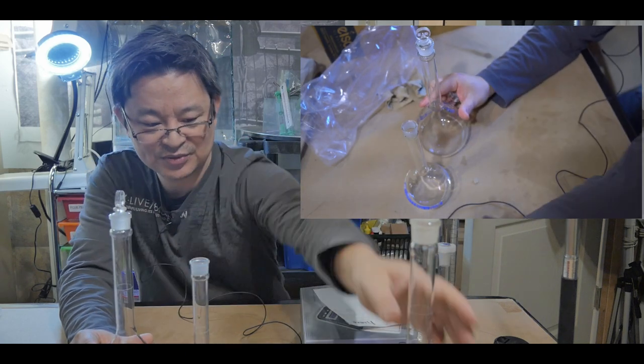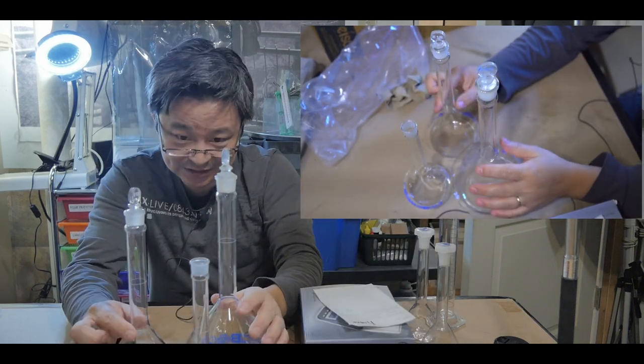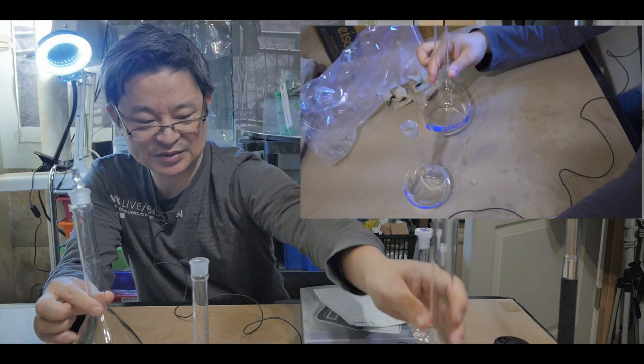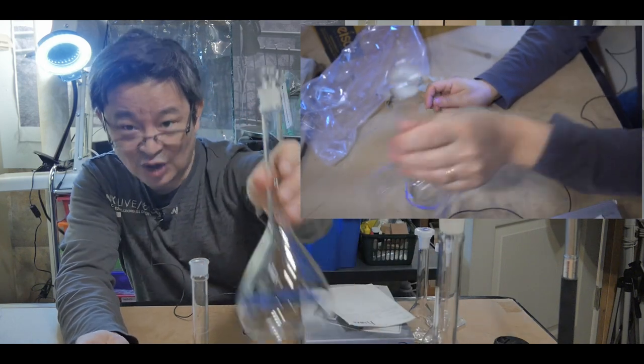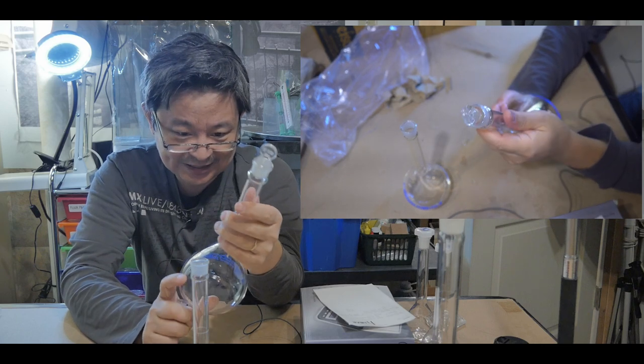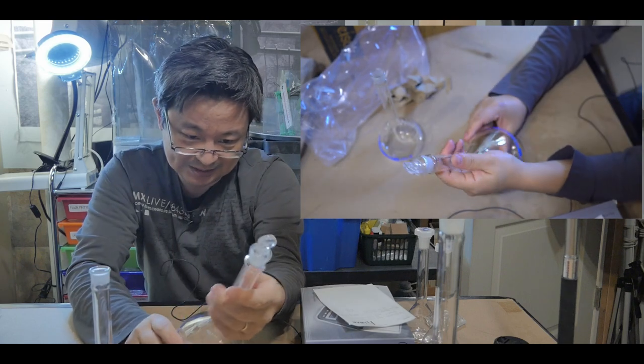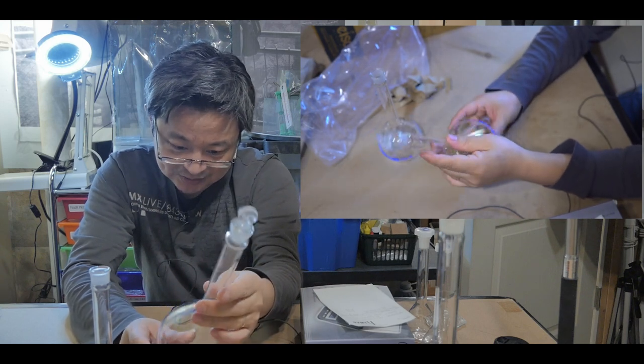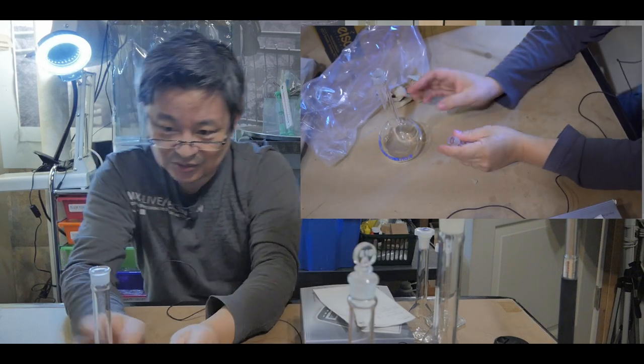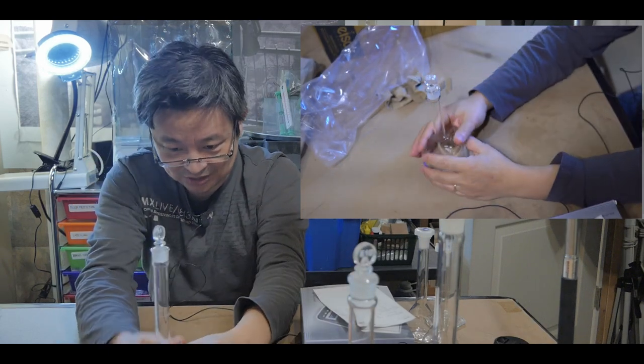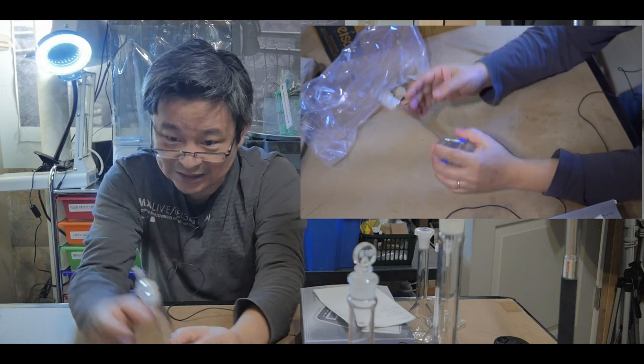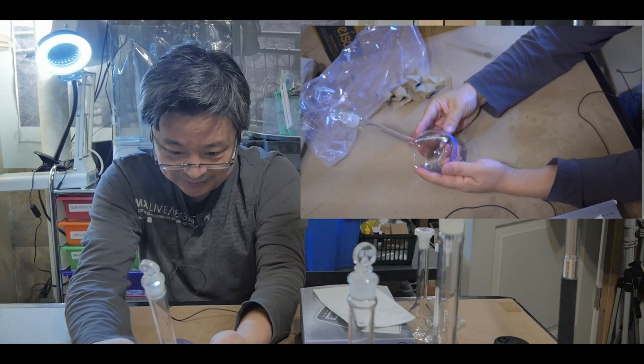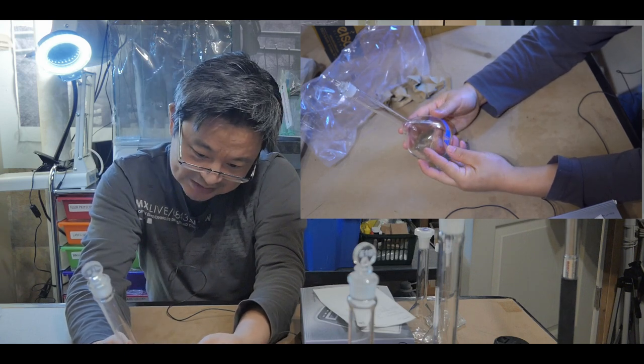But you know, for the price I'm paying, I think for all three of these - this is around $33, like about 10 to 11 dollars each - that is a bargain, people. This is a bargain price. Can't go wrong with that. Wow, I mean, normally these ones, you know, if you get Class A and it's really new, this is new, but if you do buy the high-grade one, this is going to cost you close to a hundred bucks. It's just so well built that - whoa - beautiful. This one's $16 when they put a label at 16, but I think it's worth more than that. I'm willing to pay even more than this, but because it's Class B, I guess that's why it's a little bit cheaper.